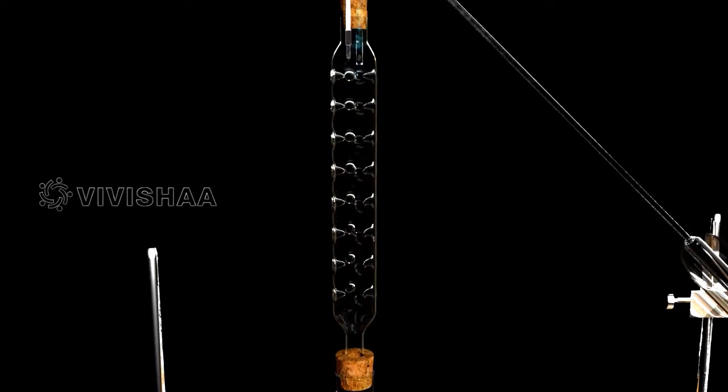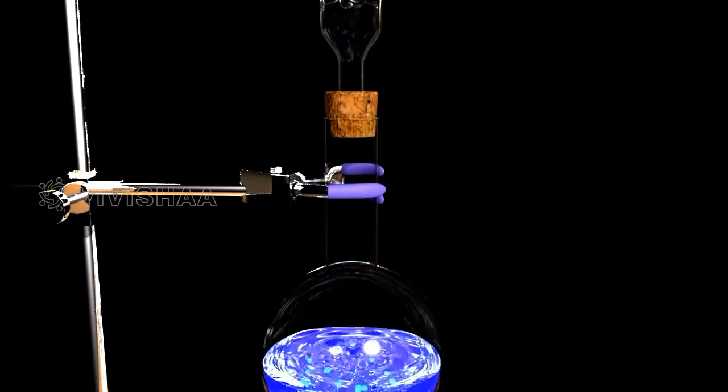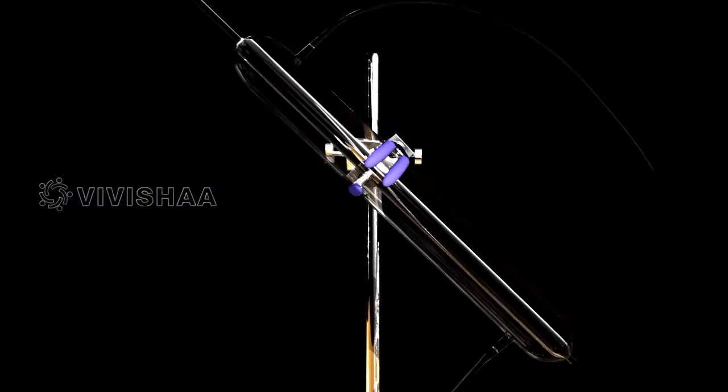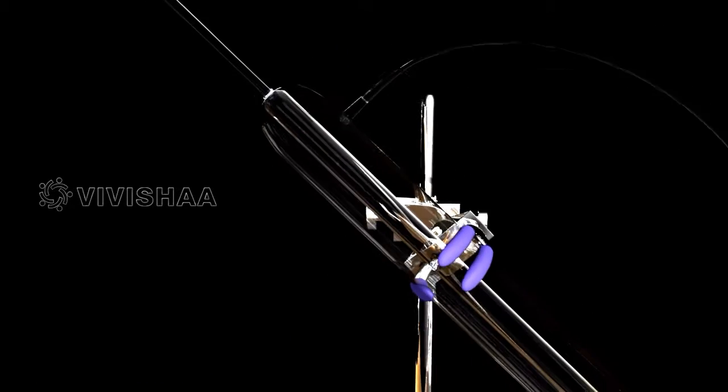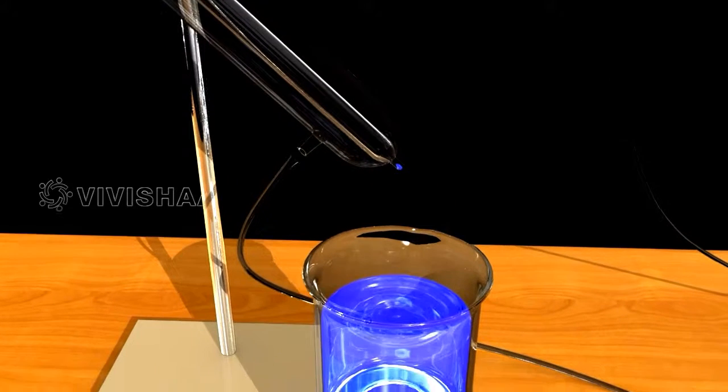The fractioning column is fitted between the distillation flask and the condensing unit which has water inlet and an outlet. The condensing unit opens into a collecting vessel.